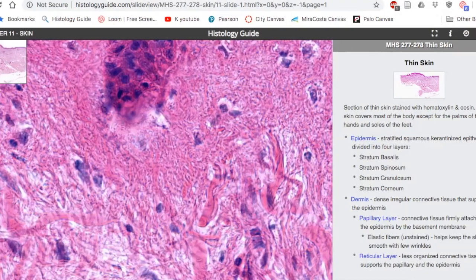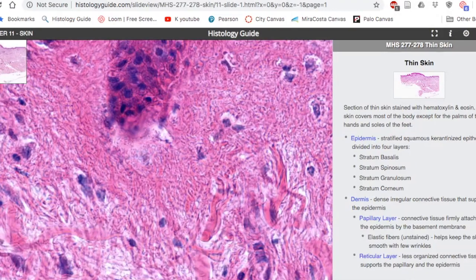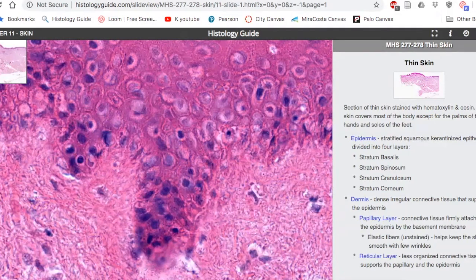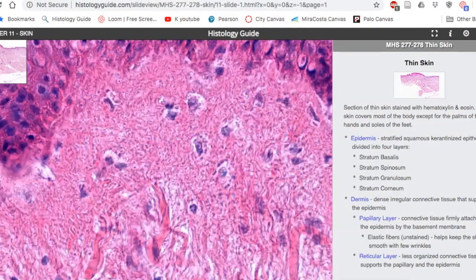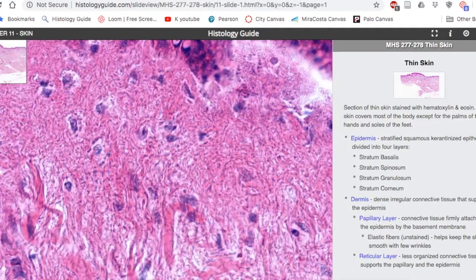That's the correct answer. That's the cell, no, tissue. I'm sorry, this is the tissue, stratified squamous, dry. This is the tissue, loose connective tissue or areolar tissue. What's the cell type? It's fibroblast. What's this? What are these fibers right here? Collagen. How do you know that?